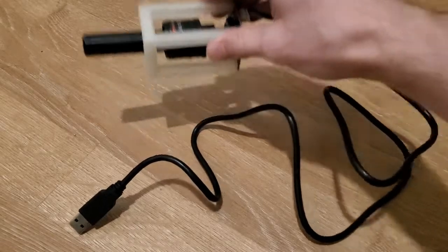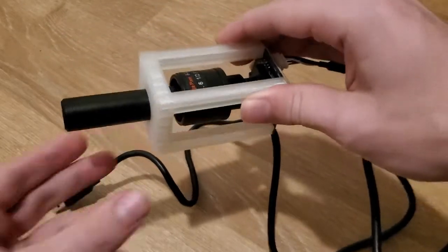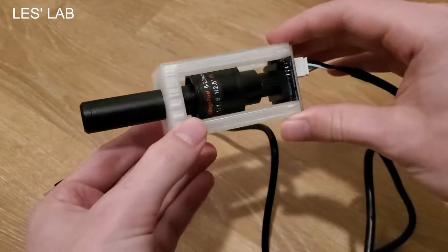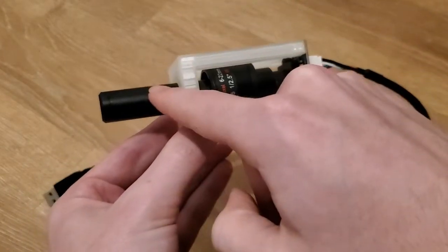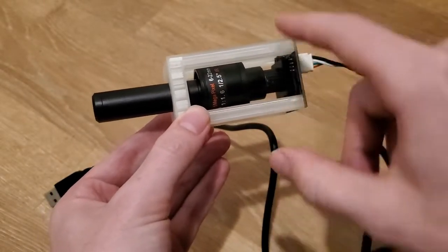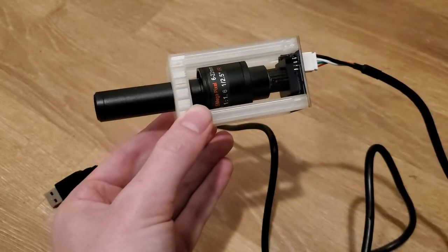Hey Qcamers, let me introduce you to my spectrometer. It's a pretty simple design, and was partially inspired by another YouTuber called Les' Lab. The main components are a handheld spectroscope, a USB camera sensor, a variable focus lens for the camera, and a 3D printed part to hold it all together.